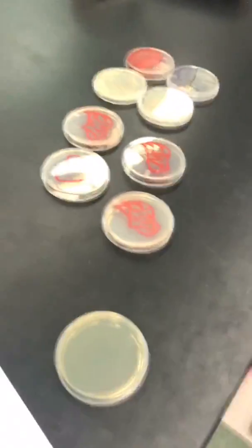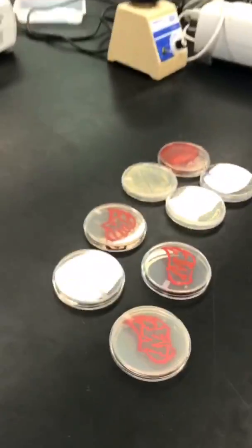Okay, today we are going to learn how to do Agar Art by Dr. Gardner. So tell us a little bit about yourself. What do you teach? Okay, I teach the micro and biochemistry labs here at Meredith, and I also teach a Gen Bio lecture course.